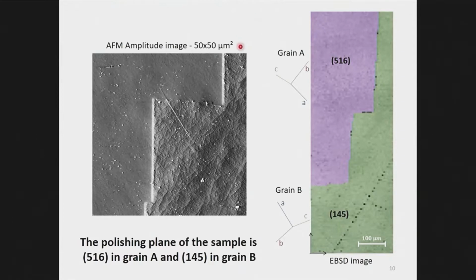If you measure the twin boundary with AFM, you can clearly see a step between the two crystals. So this is crystal 1, this is crystal 2. In between is the twin boundary, and what's interesting about the twin boundary is that it has steps inside. And you can in principle use these steps to characterize exactly which twinning system you have within the crystal.